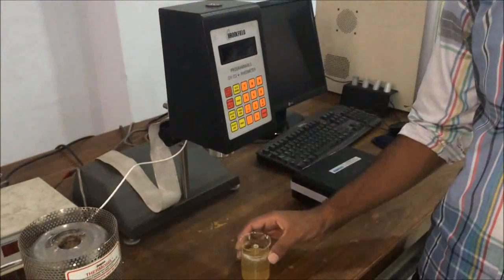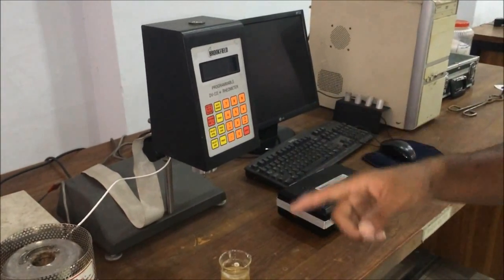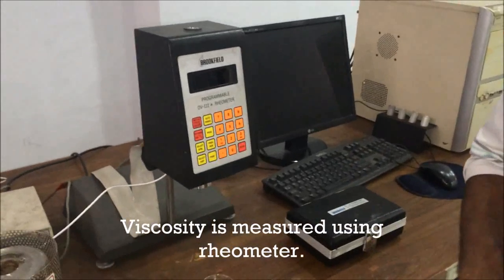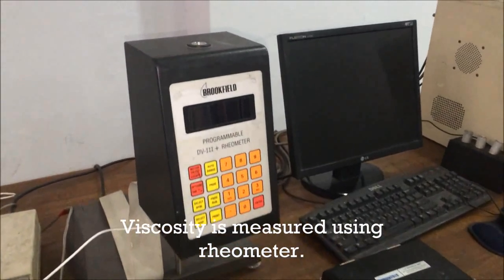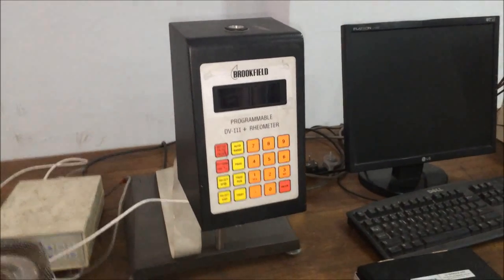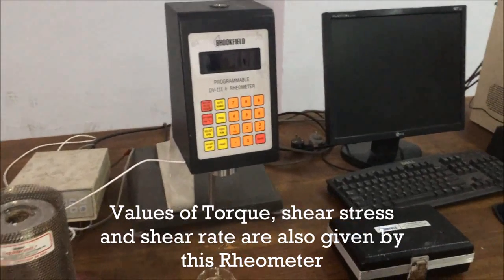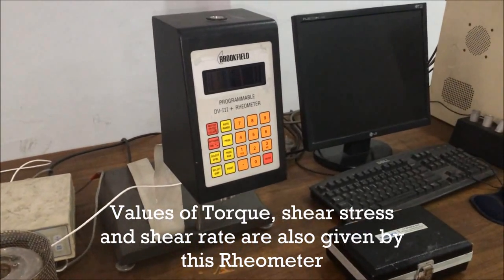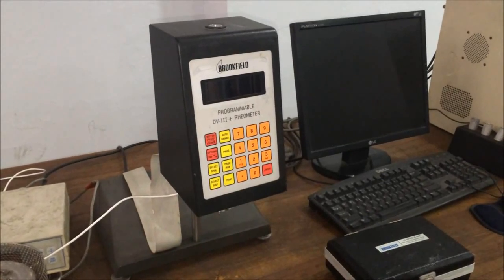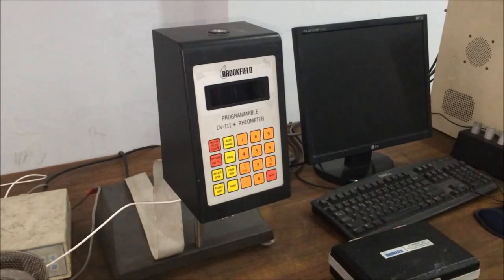Now our gelatin is ready for the measurement of its viscosity using this apparatus, which is named a rheometer. It is also named a viscometer, and it measures the viscosity of a fluid along with torque, shear stress, and shear rate. Before we start our experiment, I will tell you about its instrumentation.